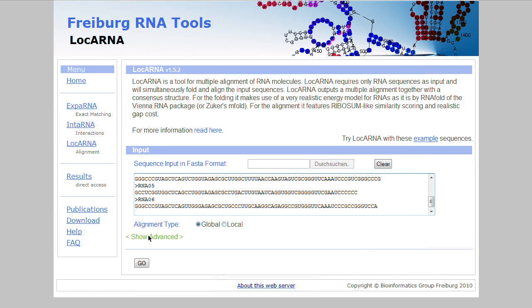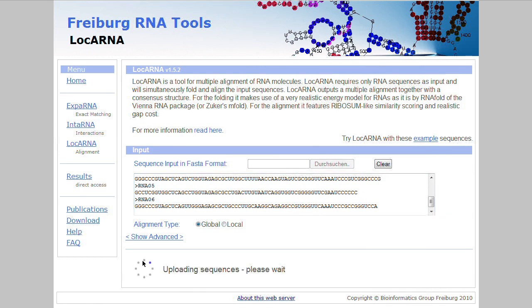There also exist some advanced options that influence the scoring of the alignment, but I'm not going into the details of this now, and instead directly click on the Go button to compute the alignment.